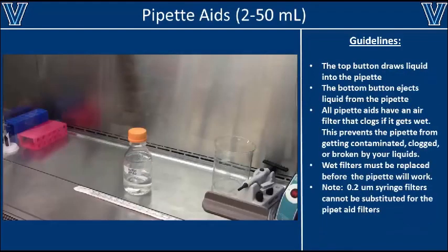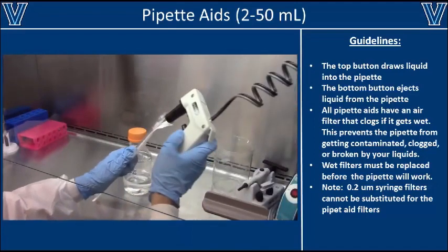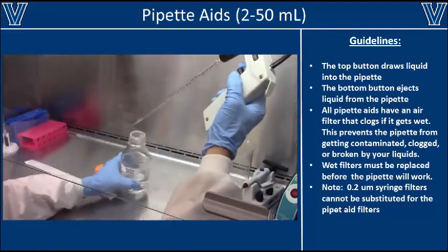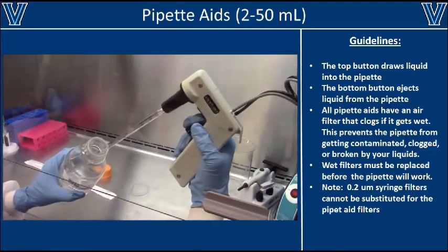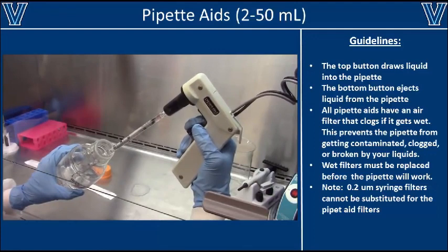If you need to transfer volumes larger than 1 ml, you'll need to use a pipette aid. Pipette aids use much larger tips with volume ranges from 2 to 50 ml. Begin by tightly inserting the tip into the pipette aid, then submerge the tip into the liquid. Draw liquid up with the top button and eject liquid with the bottom button.